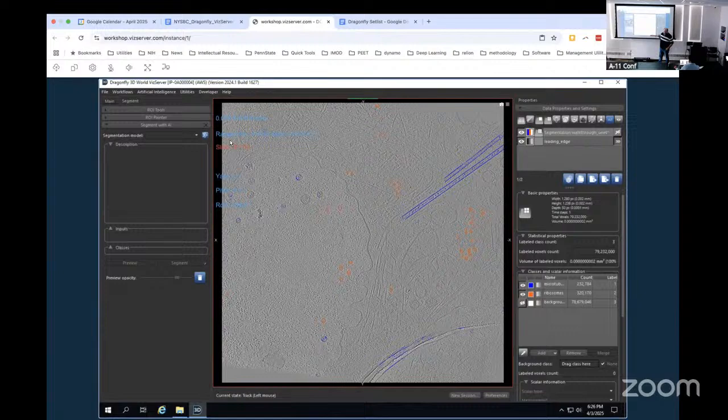All you have to do is come back in here, crop out a little piece with some of this noise in there, remove that, and push all of those false positives into the background. We can do this. I just don't know, I guess we'd have plenty of time. Okay. Actually, we'll do it on a different tomogram.